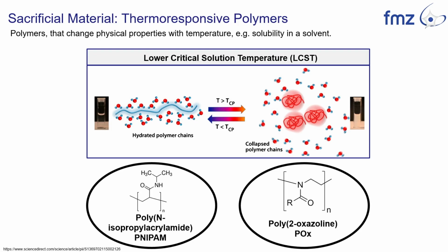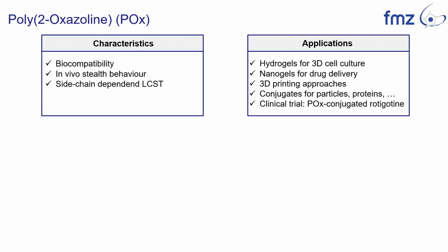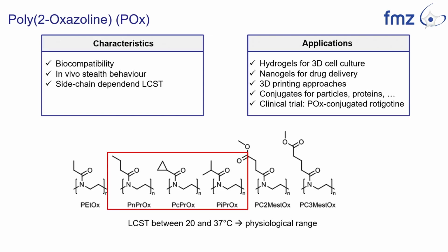There are two classes of polymer which are mostly known, NiPAM for once, and polyoxazolines. In this project we are using polyoxazolines because they are very biocompatible, they have in vivo stealth behavior, you can fine-tune the LCST temperature, and also you can 3D print this polymer. And there are also many applications already, like hydrogels for 3D cell culture, nanogels, 3D printing approaches, and also conjugates, where there are even clinical trials already ongoing.